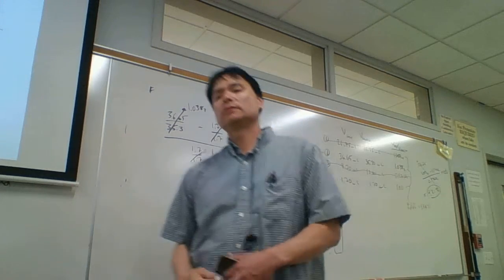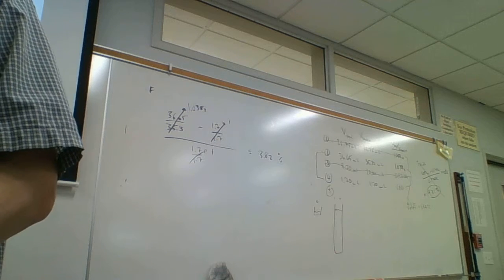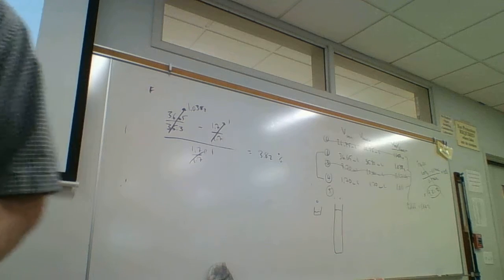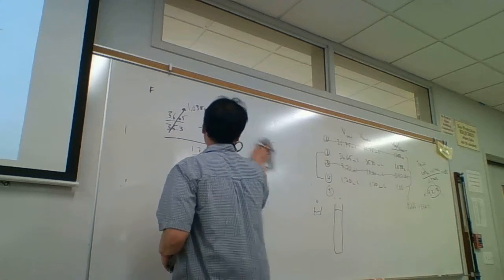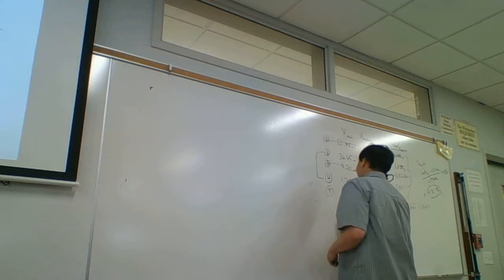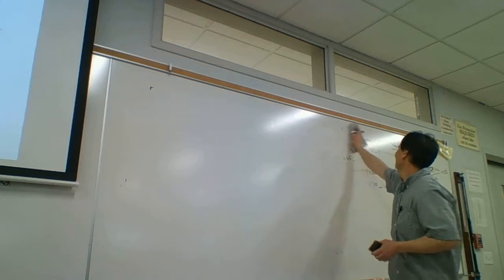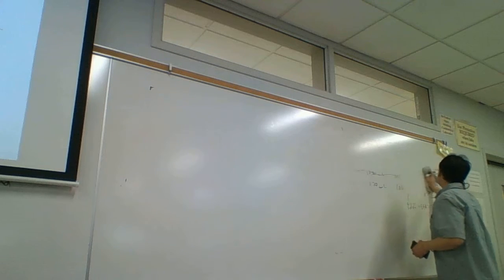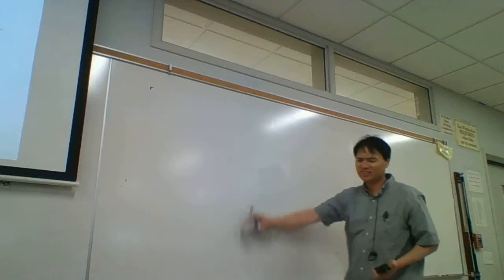So what do you need to do? You need to make sure that you got 3 good trials. Once you have 3 good trials, then we're going to do the calculation. One person ended up doing 8 trials. They had a leaky burette, and that was causing them problems.